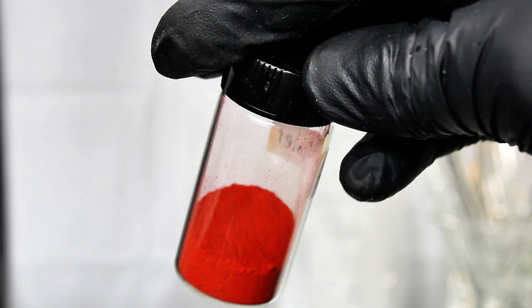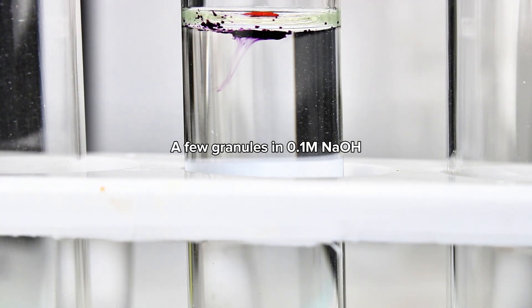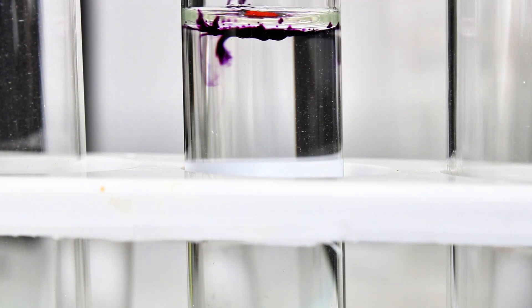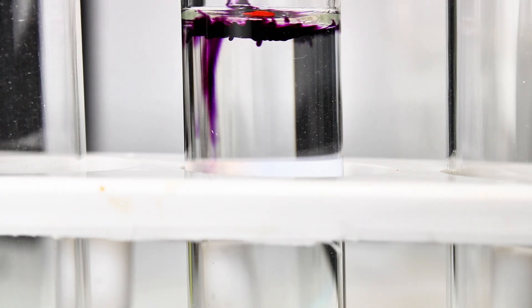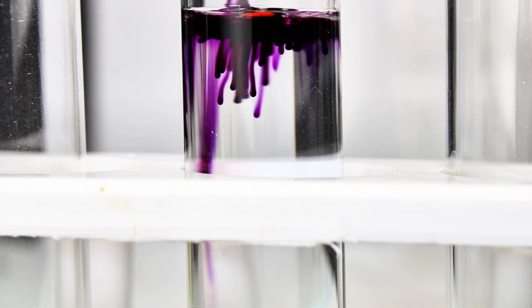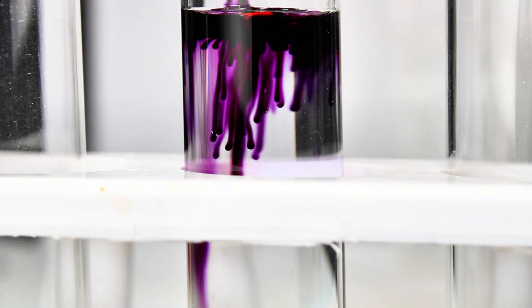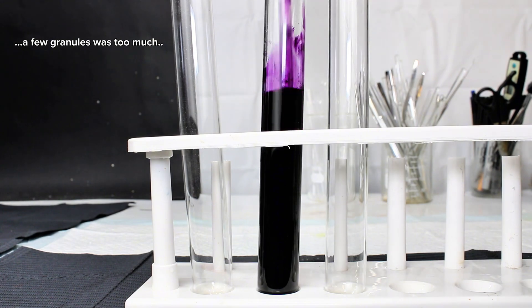To demonstrate Azo Violet, I decided to dissolve a very small amount of the powder in a weakly alkaline solution. This immediately began to dissolve the azo dye, staining the solution a deep violet, which is where the chemical gets its name. As a side note, this stuff is incredibly potent, and even a few milligrams is enough to deeply color a liter of solution. I underestimated its potency in these demos, so the solutions ended up a good bit darker than I would've liked.